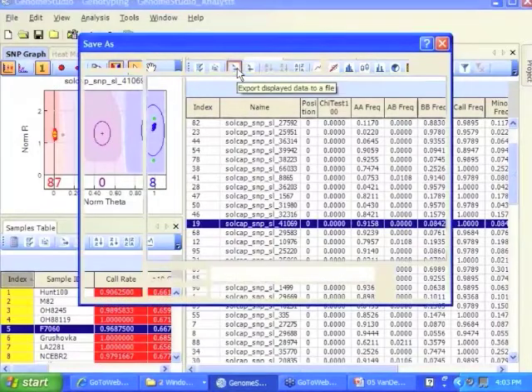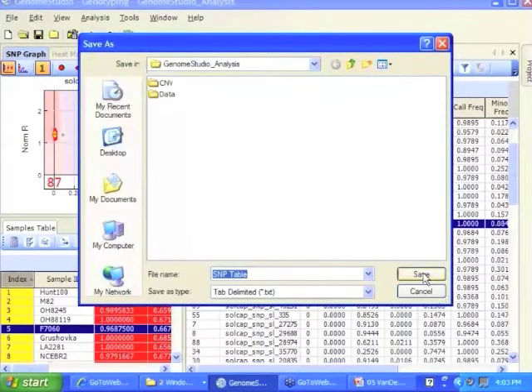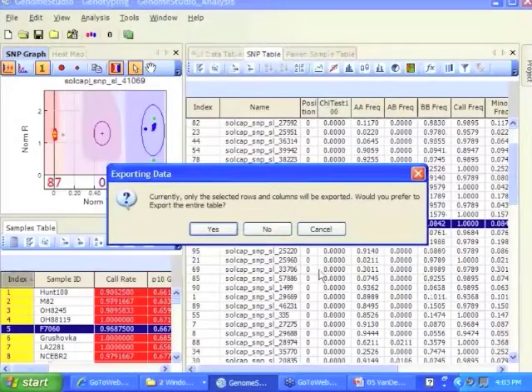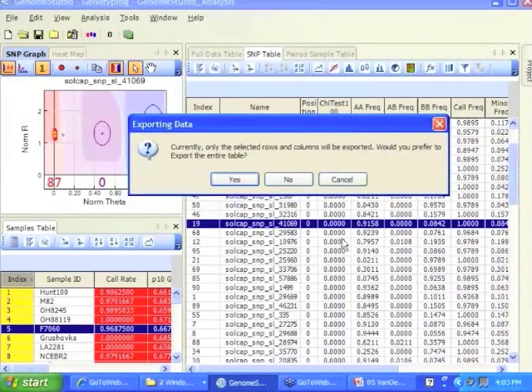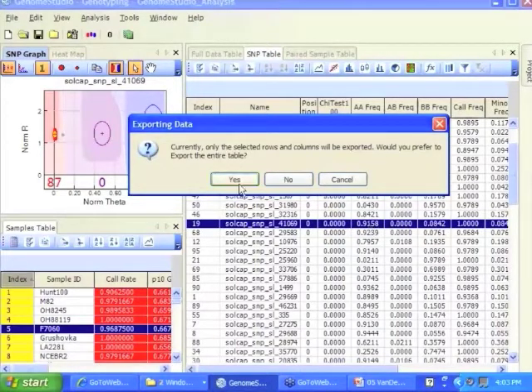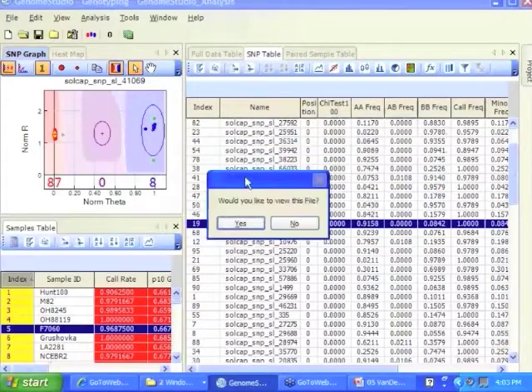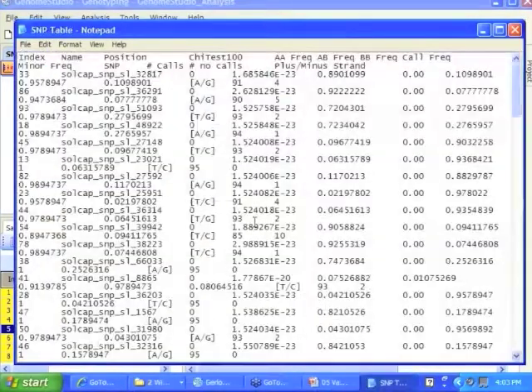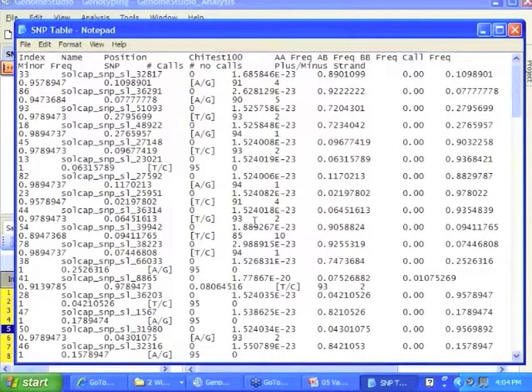So I'm going to export this data, I'm just going to call it a SNP table, and it asks me the question, do you want to export the whole table or just the data for this one particular SNP? So I'm going to hit yes. Would you like to see this file? I'm going to hit yes. It's ugly now because this is like a notepad, but you pull this up in Excel and it's all nice in columns, and then you can do whatever you like with it in Excel.